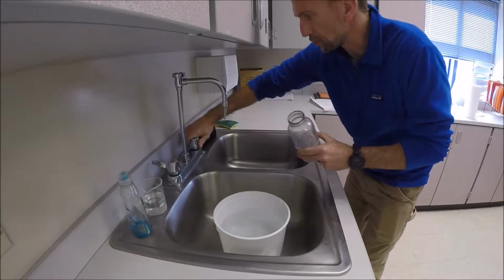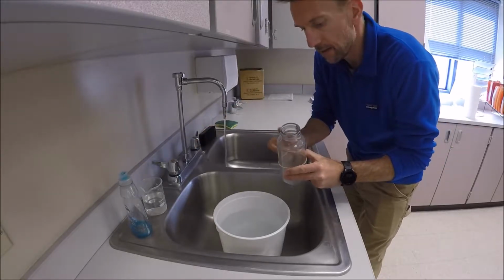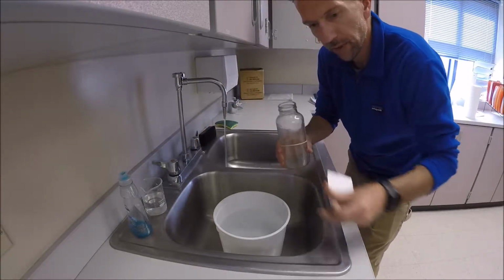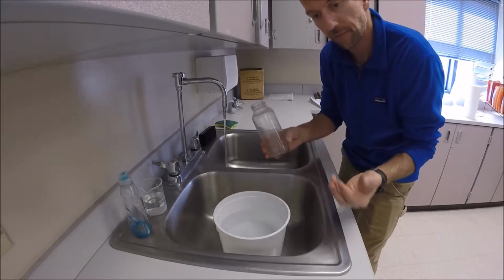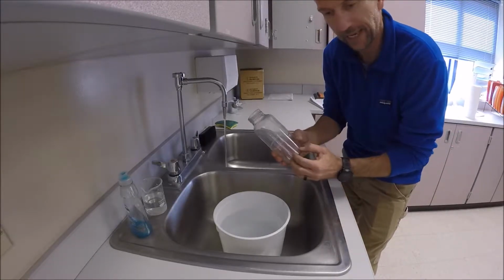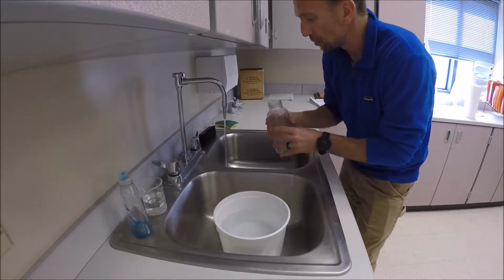Okay, so here's your little trick. You can't have any gas in this bottle to begin with, because you want all of the gas that's been collected in this bottle to actually have come from the baking soda. If you start with gas in here, it's going to throw off our measurements, because obviously we're measuring a very small amount of gas.